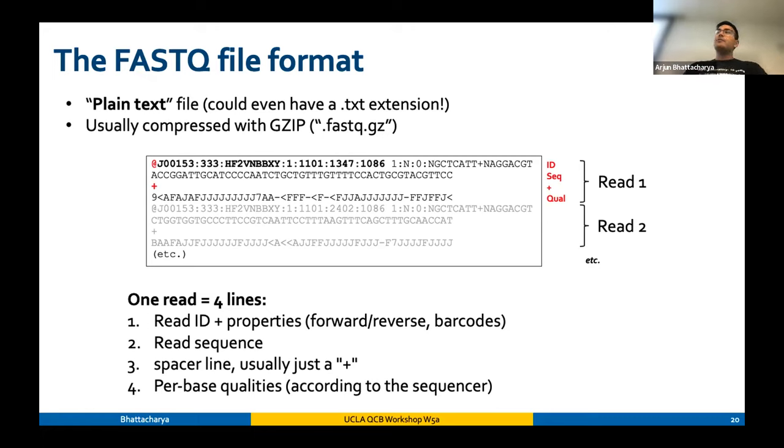The other question is, if you fix your money, sample size versus coverage, those three parameters are all that matters. 10 million reads, I think, for differential expression analysis is where you want to be shooting to get maximum power, or to get sufficient power.